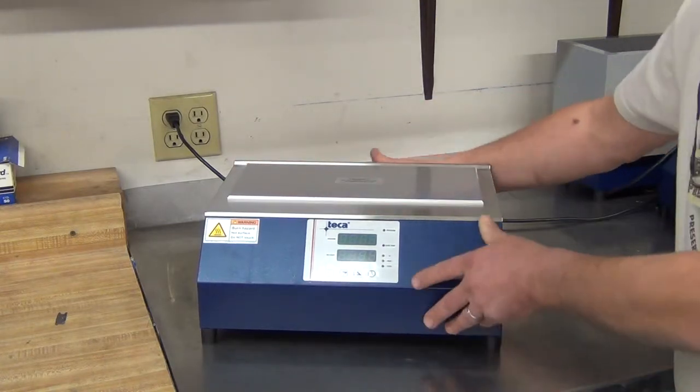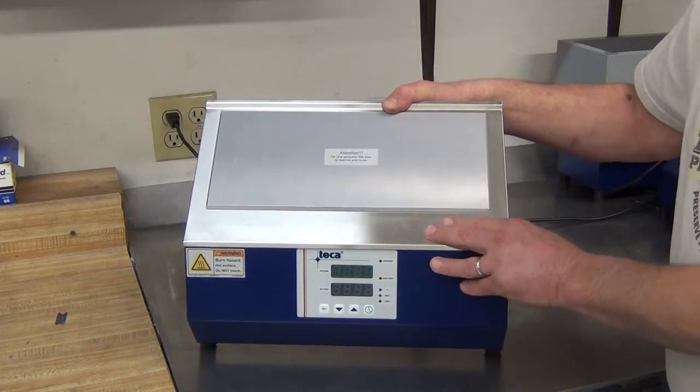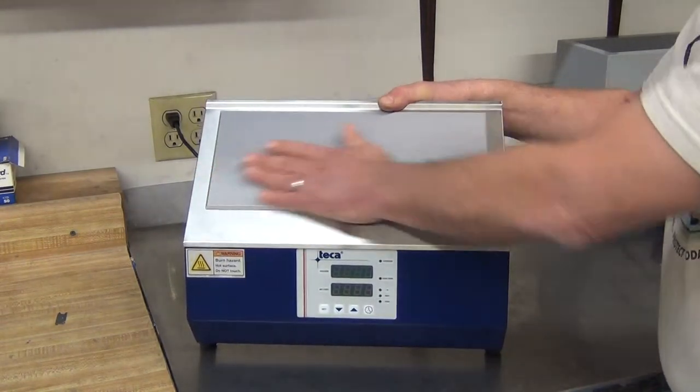This version you see here, 12 by 5 cold plate surrounded by a stainless steel apron. It's clean and clear.